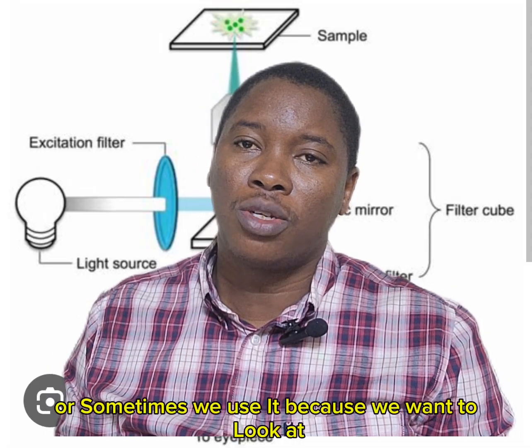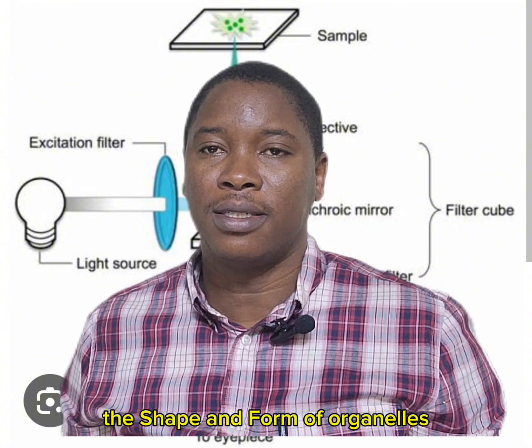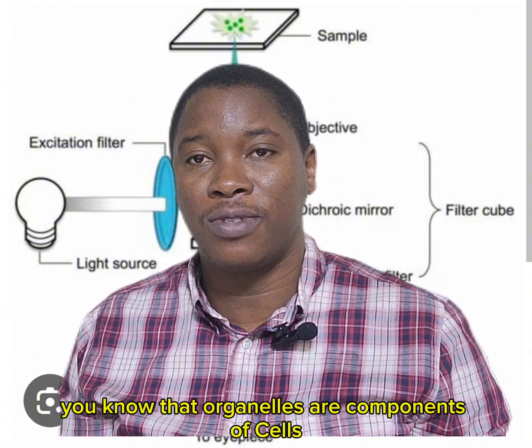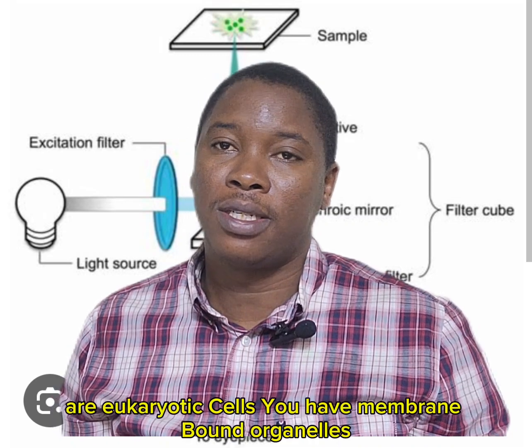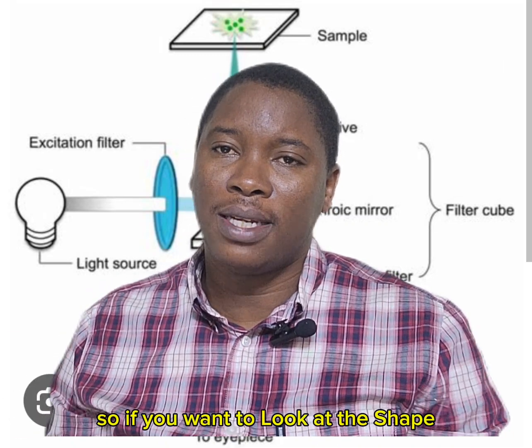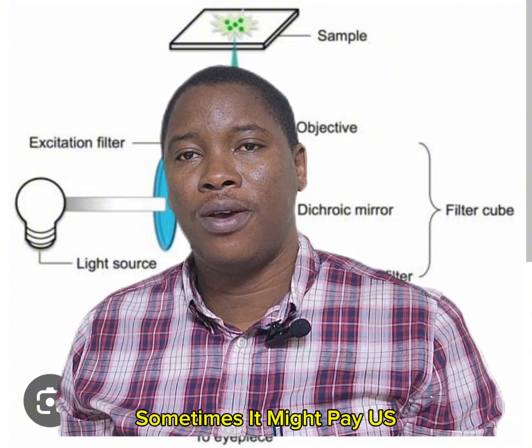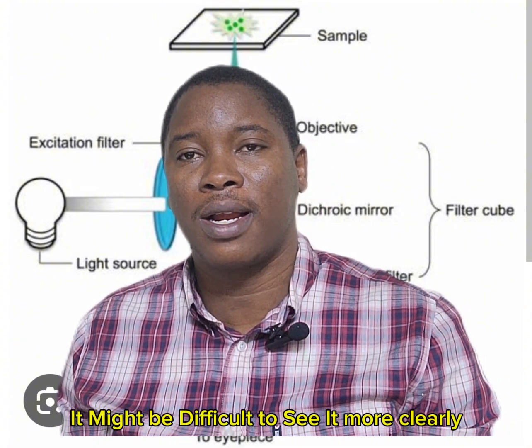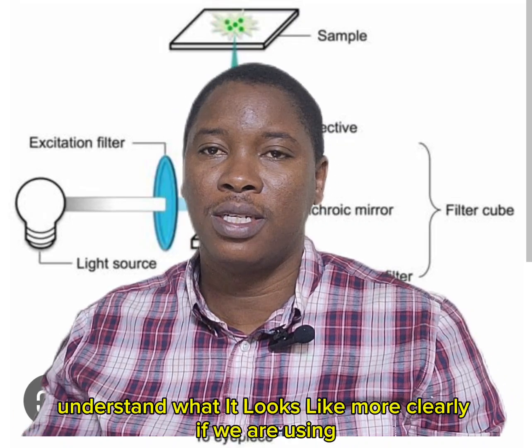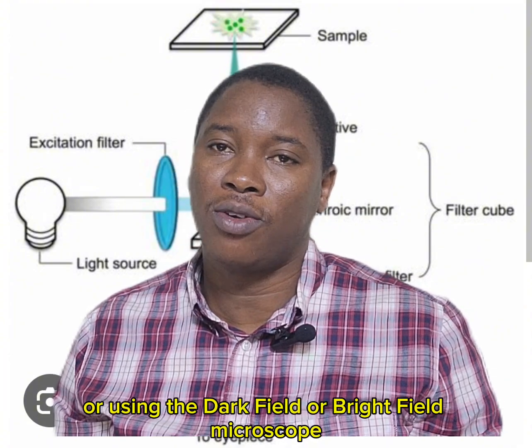Sometimes we use it because we want to look at the shape and form of organelles. We know that organelles are components of cells, especially eukaryotic cells, which have membrane-bound organelles. If we want to look at the shape, the size, and the structure of these organelles, it might be difficult to see them clearly using a simple light microscope, or a dark field or bright field microscope.